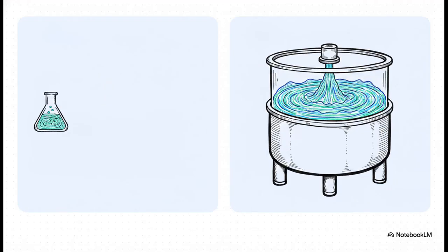But this brilliantly illustrates one of the absolute biggest hurdles in biomanufacturing: scale. Let's say you perfect this mixing process in a tiny lab tube. You can't just multiply that recipe by 1,000 to make a commercial batch. Why not? Because particle formation is incredibly sensitive to the physical mixing environment. Fluid dynamics change drastically when you move to larger equipment. Scaling an LNP process requires some serious engineering and extensive mixing consistency studies, just to guarantee that the physics of the mix remain identical. We have to ensure our final micromachines look and act exactly the same, whether we're making 10 of them or 10 million.